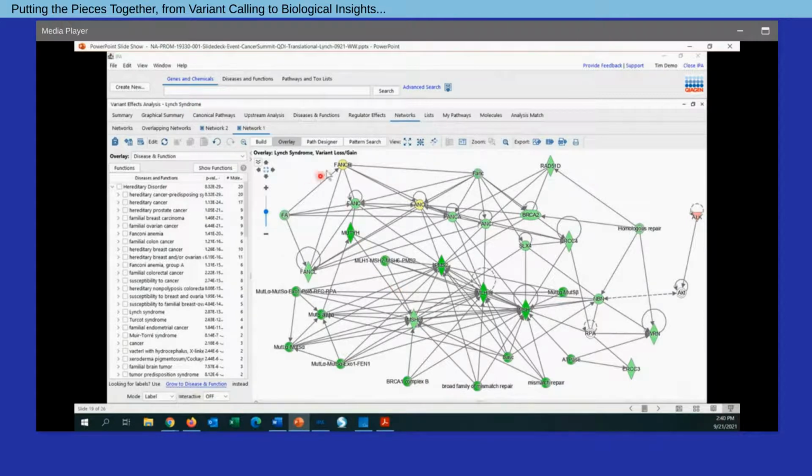So essentially, each line here represents how these two molecules would interact based on what we know from the literature. And within this interaction network, we can take our set of genes that we've defined that have a likelihood of neighbors of interactions that could overlap with each other. And we can look at different functional aspects that are enriched in this set of genes.